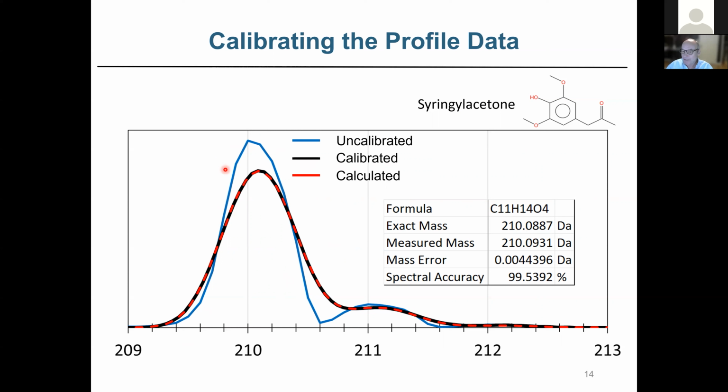And it's typically asymmetric. It's consistent from run to run, but you're not able to model it directly, because what we would like to do is calculate the spectrum that we think the compound is, and we'd like to match it.